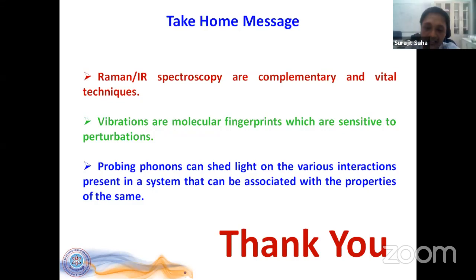And depending on that, some new modes may appear. And that is why the Raman spectrum may show some shift or slight differences. Additional thing that one may also see is when you change the laser wavelength, if there are some fluorescence or photoluminescence transitions involved, some lasers may not excite those photoluminescence transitions. And that is where you'll see purely vibrations in the spectrum.